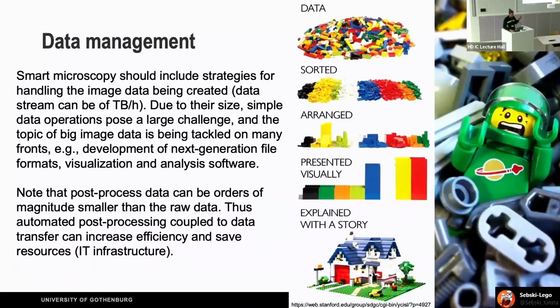Now, as you will see, one of the things that is going to quickly happen if we are successful with this is that, in my opinion, smart microscopy also must include strategies for handling the data that we are generating, because we can easily start to create terabytes of data sets very quickly. And due to the size, simple data operations that before you could just do on your laptop or your computer are not possible anymore, right?